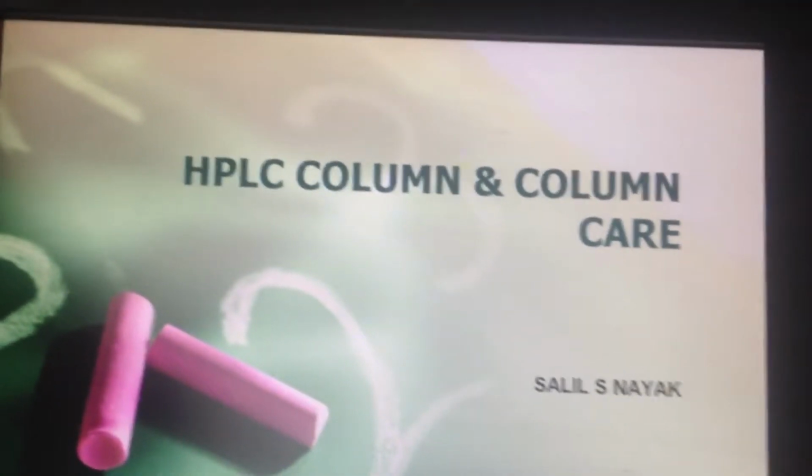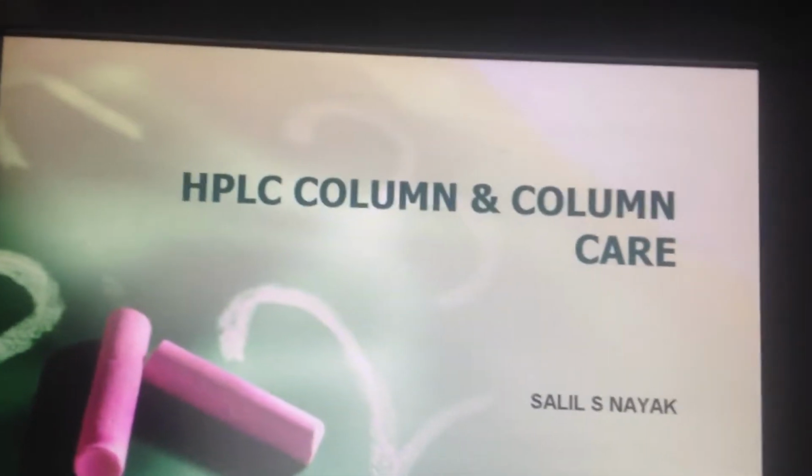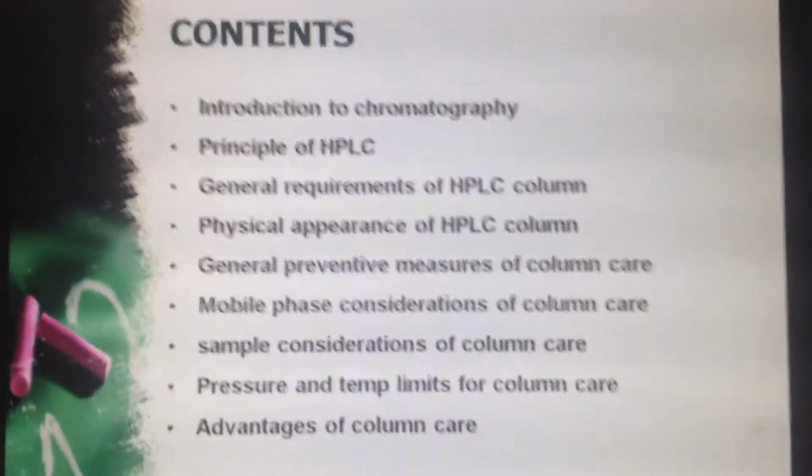I am here uploading this video for all of those which will help them to increase the life of the column. So let's see the topic, HPLC column and column care. Let us see the contents.